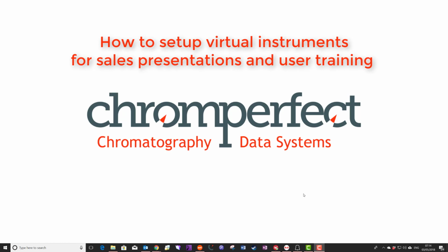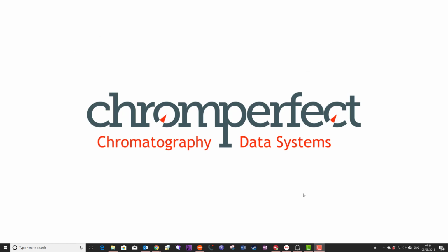In this short presentation, we will be using a useful tool for product demonstrations and user training. I will explain how to set up a virtual instrument for data acquisition. This feature can be very useful for distributors and resellers who want to demonstrate real-time data acquisition to potential customers.